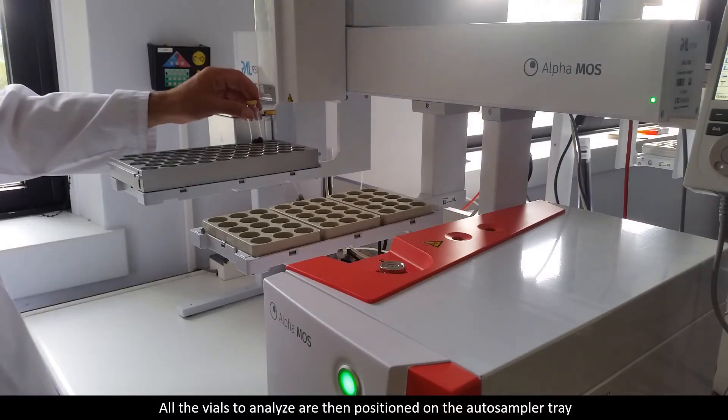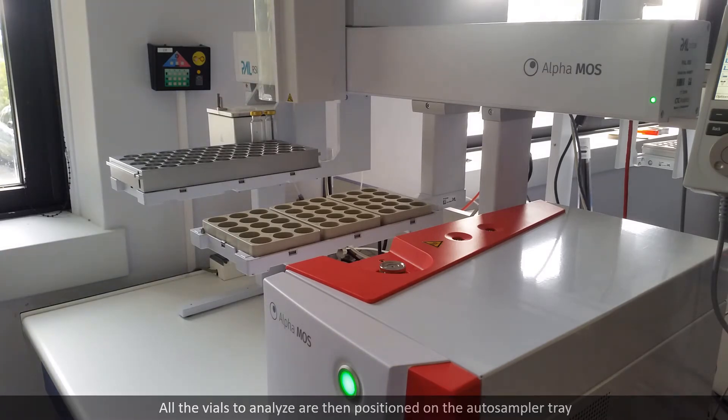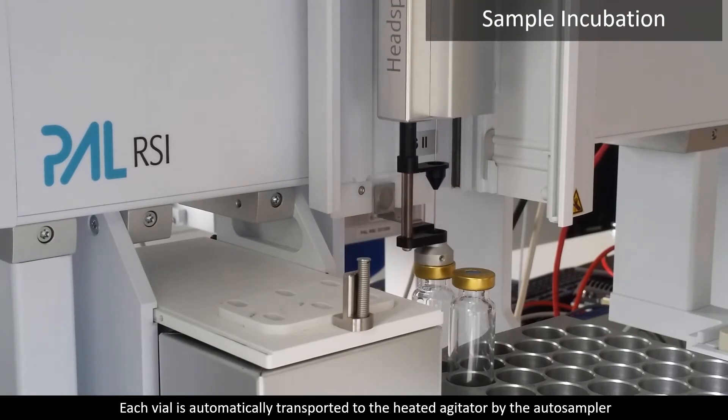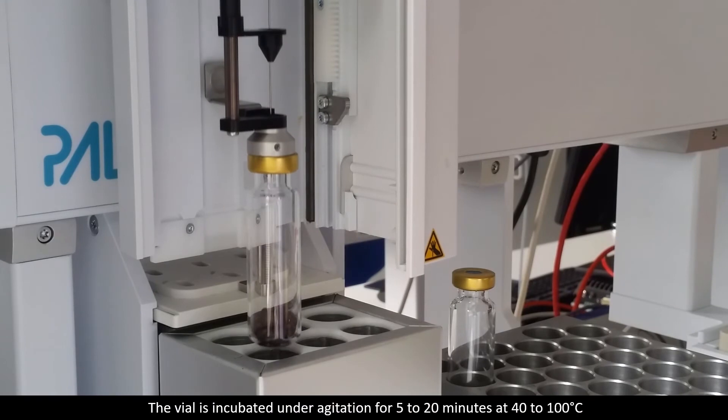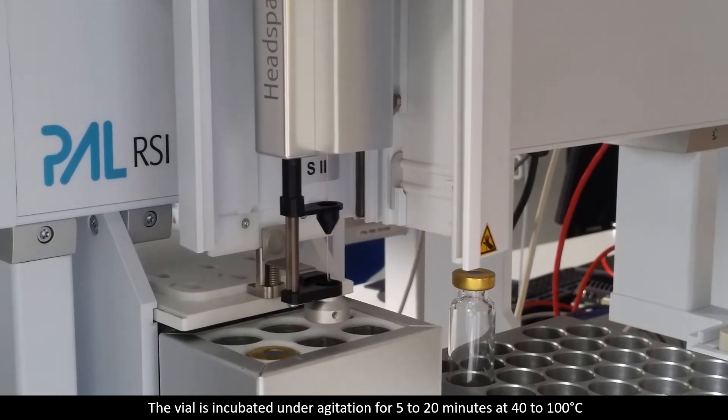All the vials to analyze are then positioned on the autosampler tray. Each vial is automatically transported to the heated agitator by the autosampler. The vial is incubated under agitation for 5 to 20 minutes at 40 to 100 degrees Celsius.